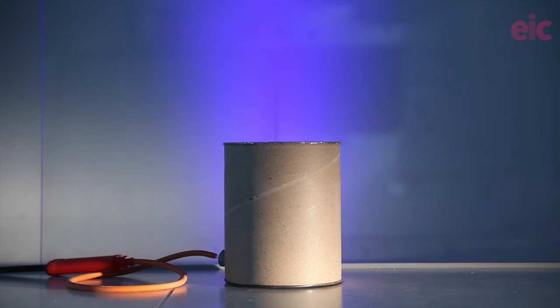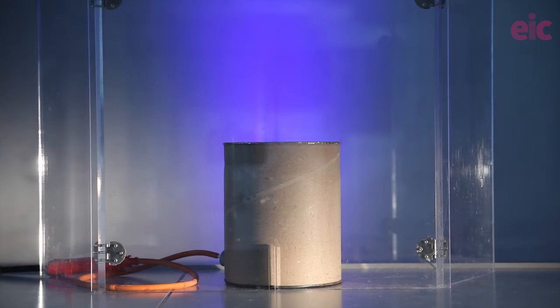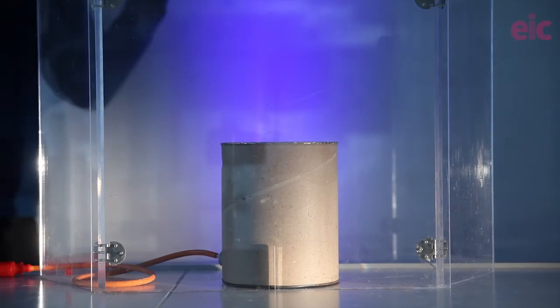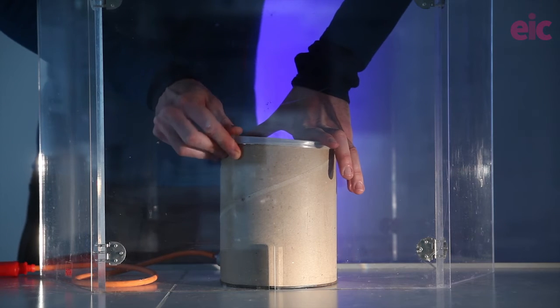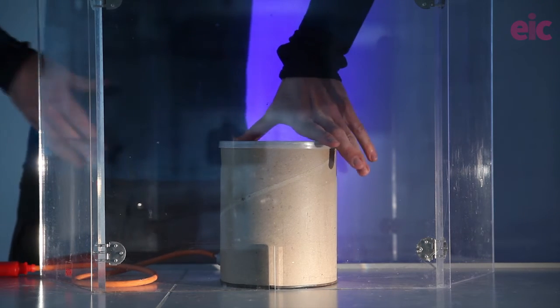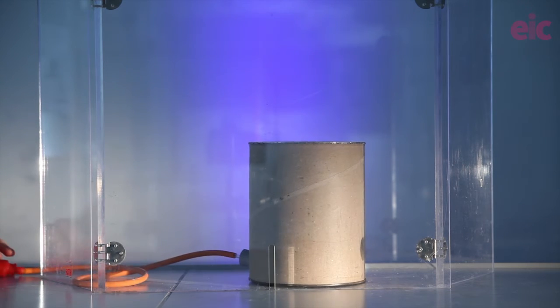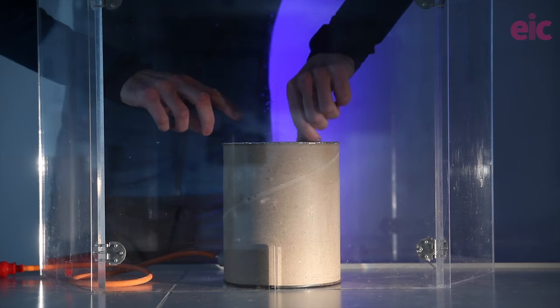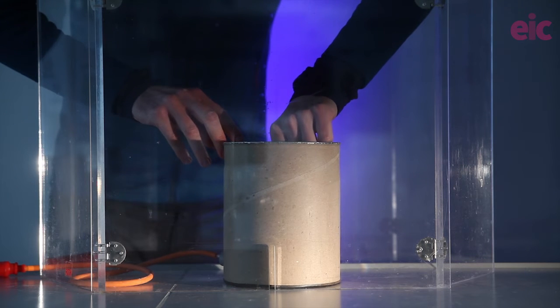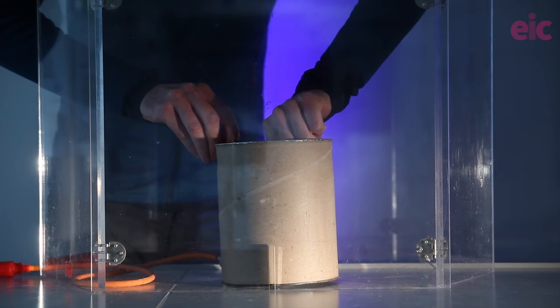Dim the lights and set up safety screens in front of and behind the apparatus to ensure that the lid can only escape vertically. Fit the lid on top and give it a puff. You can usually get a few blasts out of the same pile of powder. Having that spoon to hand allows you to reform the pile over the end of the tube.